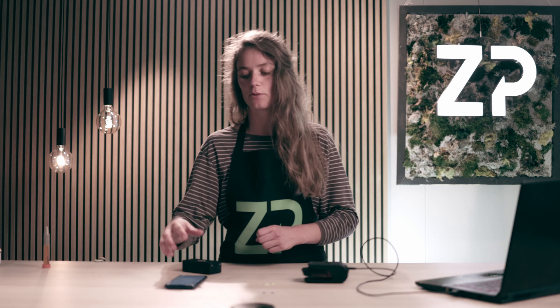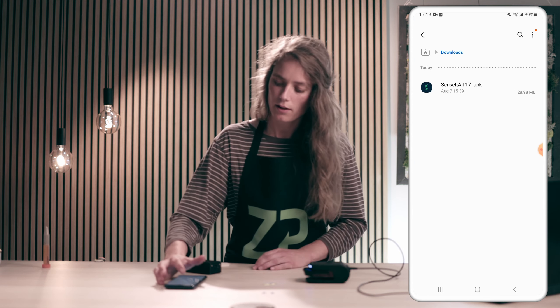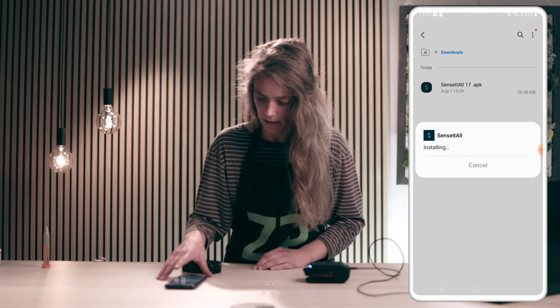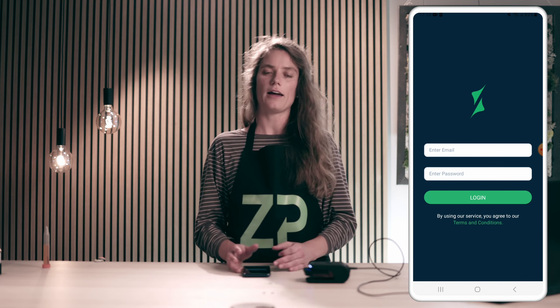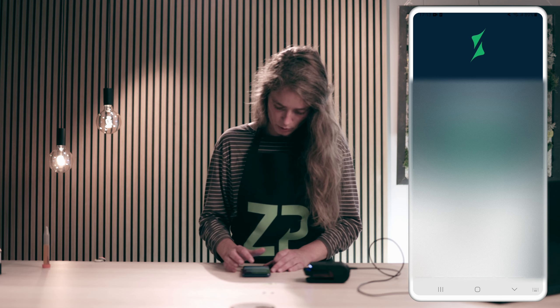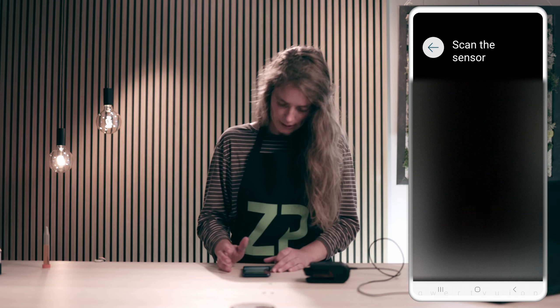Then I need to connect it to Bluetooth through the SenseIt All app. The SenseIt All app you will receive when you receive your device. You'll go to your phone, download the app, and install it — it will just take a few seconds. I will open it and then connect the app to my Juvee account, entering the same email I use for my Juvee account, typing in the password, and clicking login.